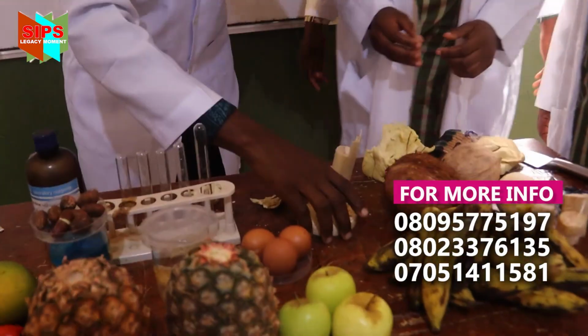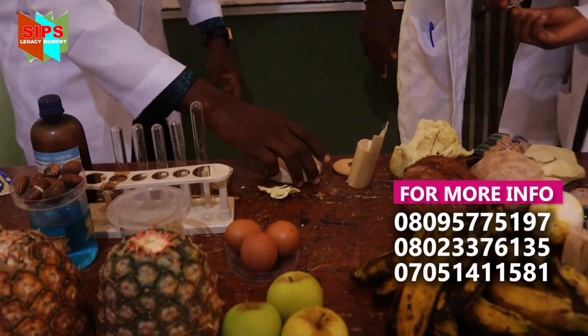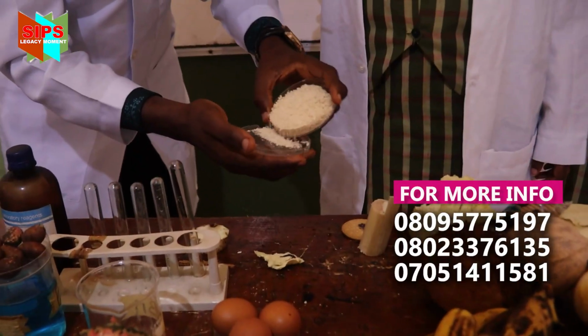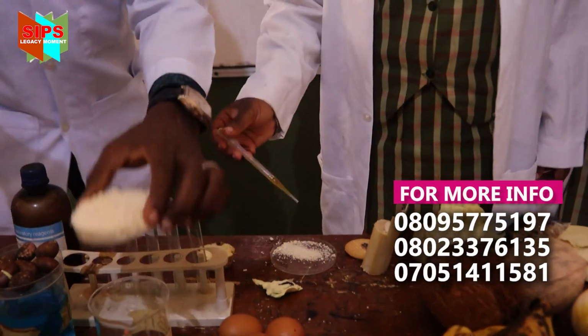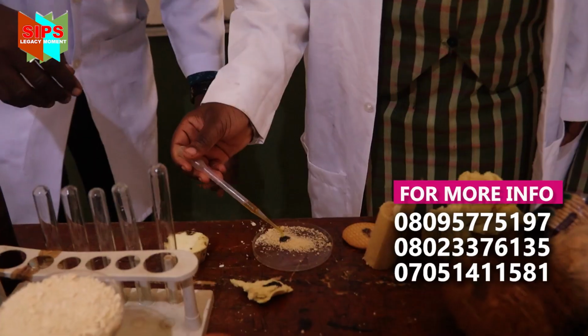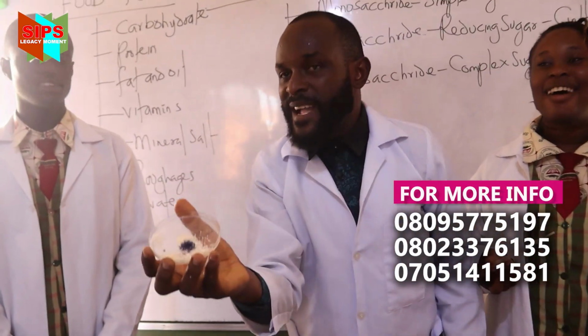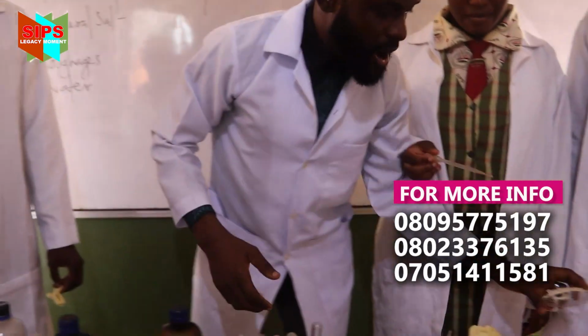Now, please come for gari. Let's see to show whether starch is also present. Let's take a little portion of it. Now, please, let's check. Add. Now, expected color change? Blue black.